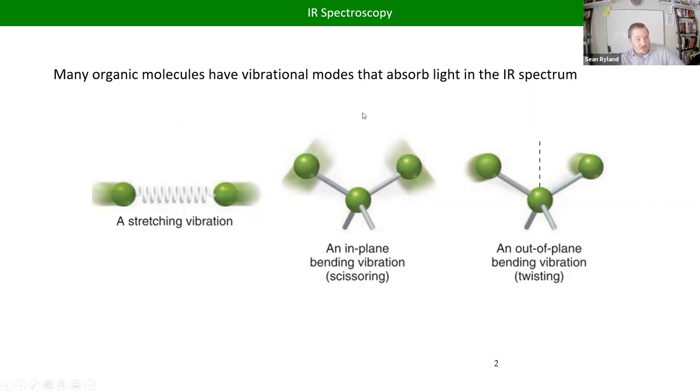And so that's actually what we're going to measure with IR, is mostly we're looking at stretching vibrations. Because if the right wavelength of light, if the right frequency of light hits those bonds, it'll make the atoms vibrate back and forth faster. Which is why light can make things warmer. Basically what we're doing is shining light of a frequency, and then when that light is absorbed, it turns that light into vibration of the atoms.